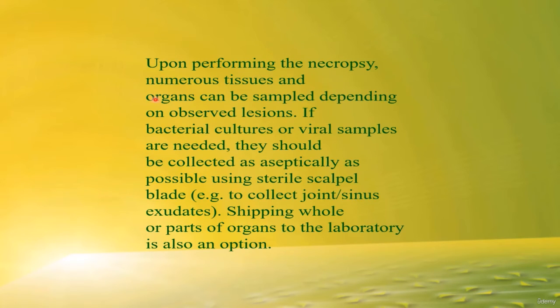Upon performing the necropsy, numerous tissues and organs can be sampled depending on the observed lesion. If bacterial culture or viral sample are needed, they should be collected as aseptically as possible using a sterile scalpel blade. Collect joint sinus exudate. Shipping whole or part of the organs to a laboratory is also an option.